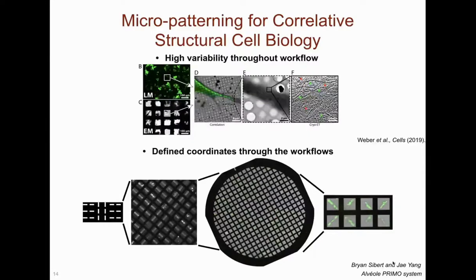An area of development in our lab and in other labs is micropatterning to support complex cell culturing experiments and improved automation through CLEM pipelines. The leading rationale for micropatterning is that cells, be they eukaryotic or prokaryotic, do not grow in 2 dimensions or in isolation. Therefore, technologies can be developed to support the expansion of the native in situ microenvironments on a substrate.